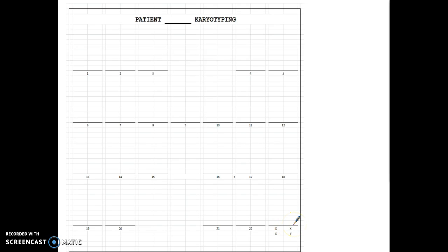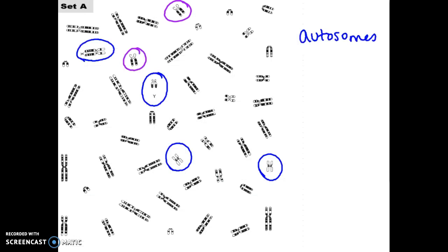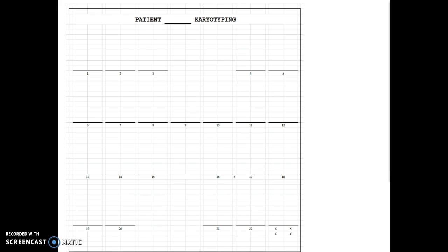In the case of some of these karyotypes, there will be a third or even missing chromosome down here. And I'll explain that in a few minutes. What you do first, I would suggest isolating the sex chromosomes. So I would go back here and I would cut this chromosome out and this chromosome out. So they're kind of out of the way and they don't get distracted and being put into where the autosome should be. I would cut them out and place them right.